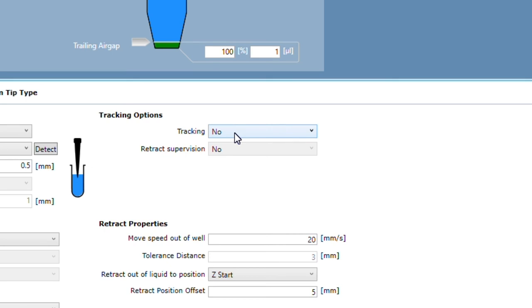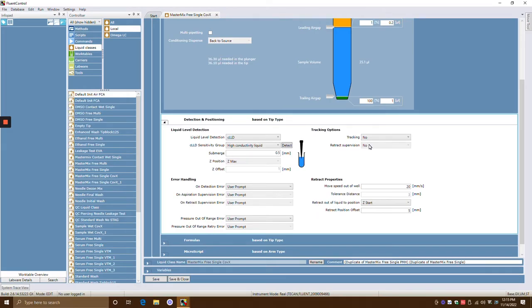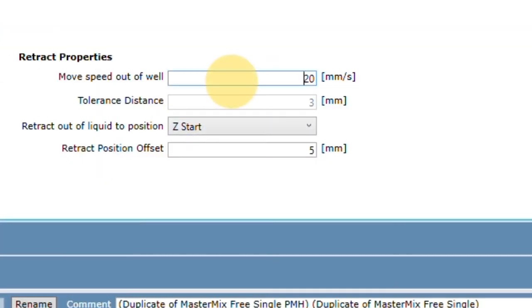You can have tracking, which senses the level of the liquid as you go up and down. Tracking retract supervision means that when you're pipetting, say, 20 microliters out, it will try to make sure the expected height matches where those 20 microliters would be as it retracts. If it's off, you'll get an error — retract supervision makes sure that whatever you spit out was actually spit out. Retract properties is for moving speed — how fast the pipette comes out of the well after you aspirate.